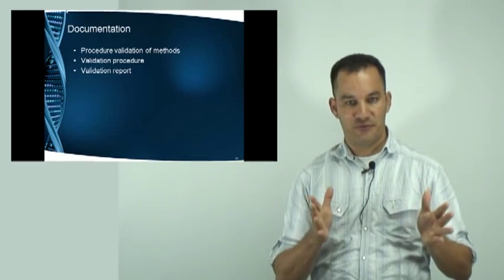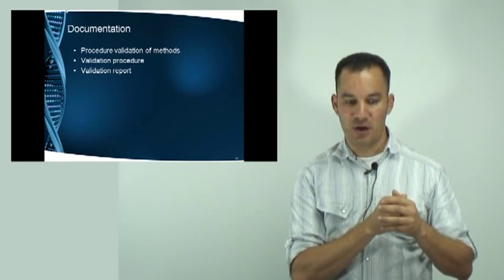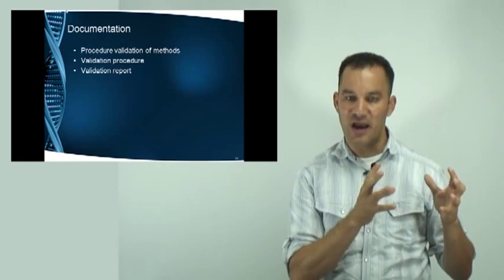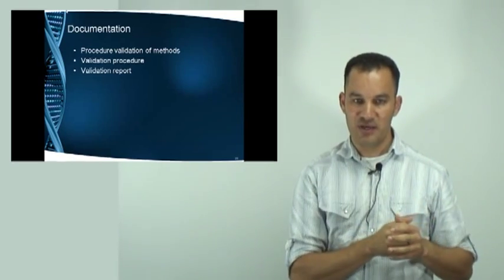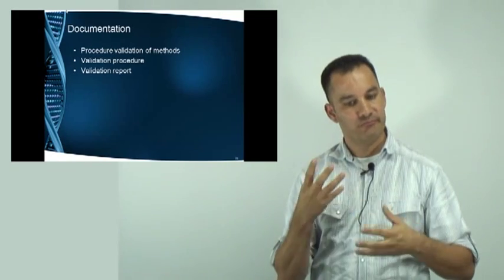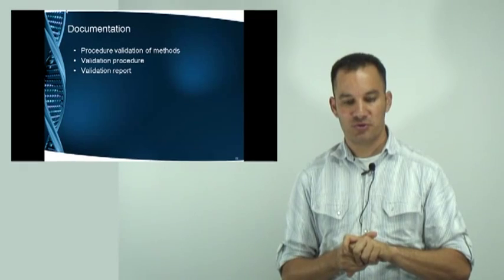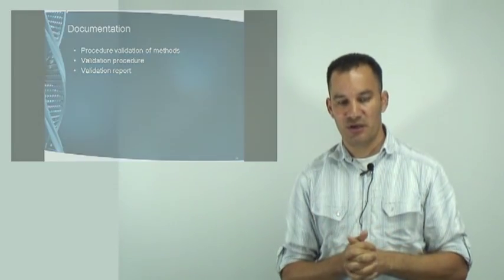So in a nutshell, I've presented to you the information on what the international guidance on validation is and how this is translated into practical use or practical experiments here on the islands.